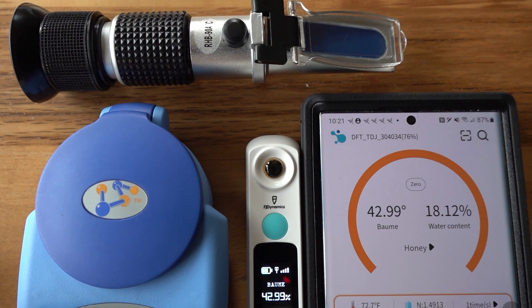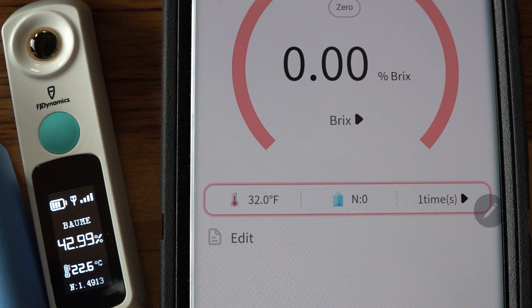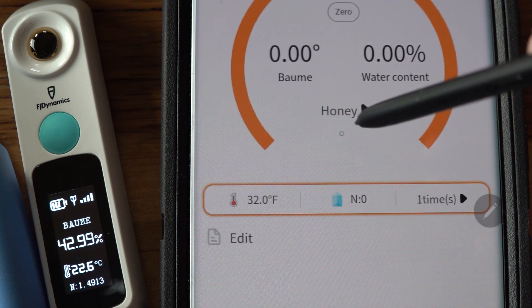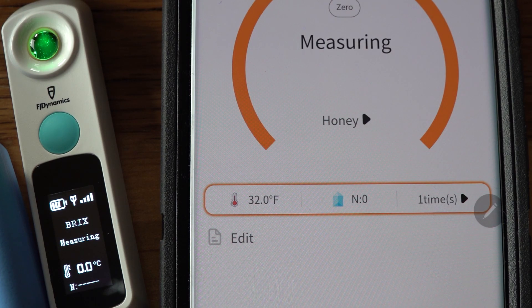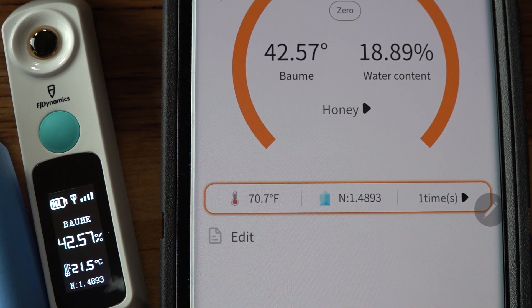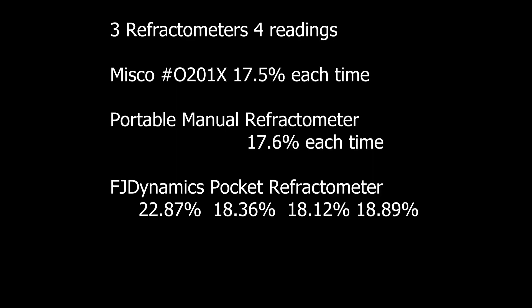Between these three, I have to tell you: if you've got the money and want a very accurate system, you're looking at the MISCO — the blue one on the left. If you want accurate results that are manual, require no batteries, and just need user skill, go with the manual refractometer. The FJ Dynamics unit is a little finicky, the battery goes down fast — under an hour it was at 76% from a full overnight charge. It's a pocket unit, convenient, and costs about $159, but you will have to use your phone — it's not standalone. I hope you found this review helpful. Thanks to the company for sending it, and I see lots of room for improvement. Have a great weekend.